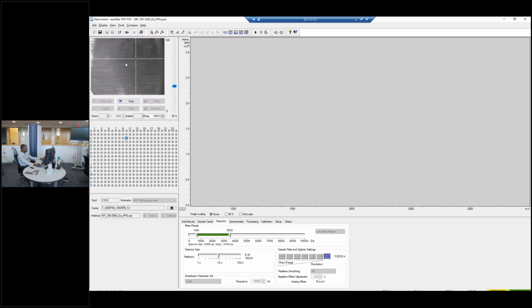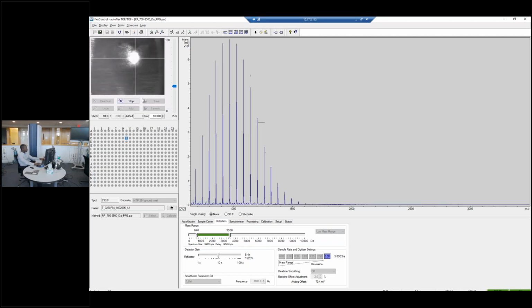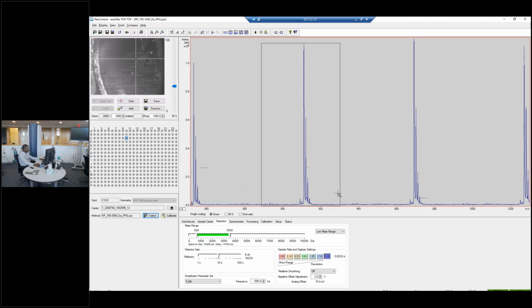It's taking just a few minutes because the laser has to warm up a bit before it can start firing. And as you can see, right off the bat, I'm already getting really good results without having to adjust anything. So let's zoom in to see what we're getting.